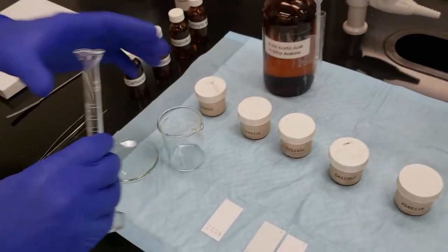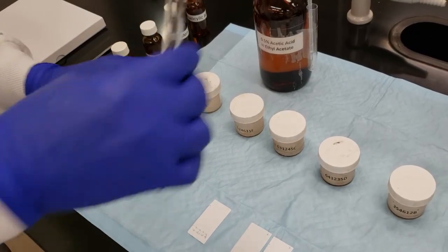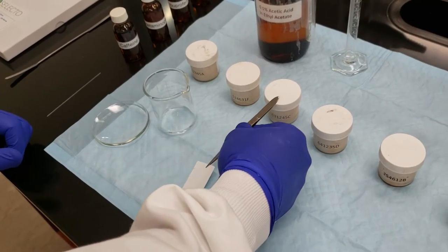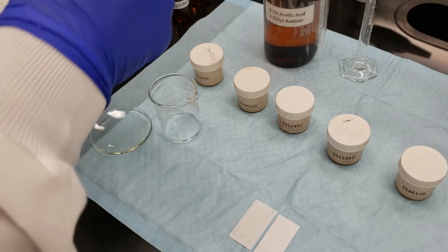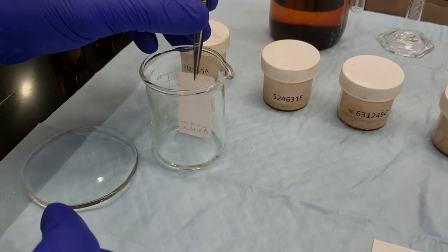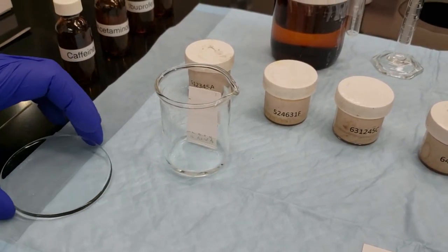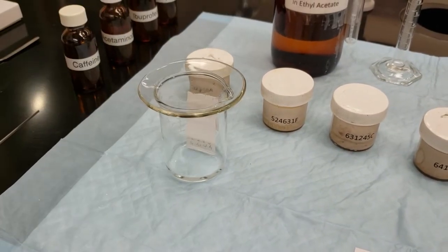So we take our 5 mils, pour it into the bottom of our 100 mil beaker. We'll put the watch glass on last. We carefully pick up our plate, as we want to set this down as straight as possible in our solution. We want our mobile phase moving up and parallel to the bottom of the plate so that we don't have any skewing of our different lanes.